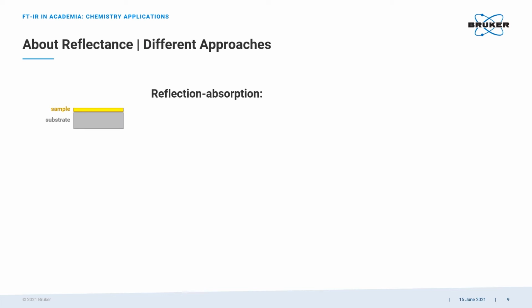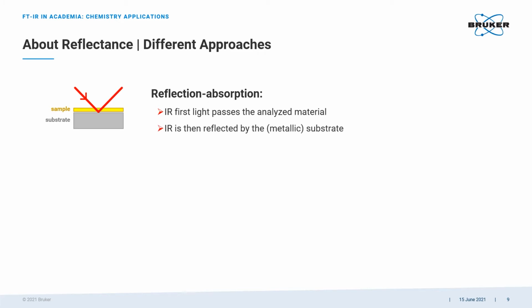Here we are using a reflecting background, for instance a metal mirror, to reflect the IR light behind a sample of interest. This could be a tissue section in biochemistry, very small and thin crystals, or thin layers of liquids and coatings. This is more or less a transmission measurement that offers twice the path length through a sample material. It therefore increases the spectral quality for very thin samples.